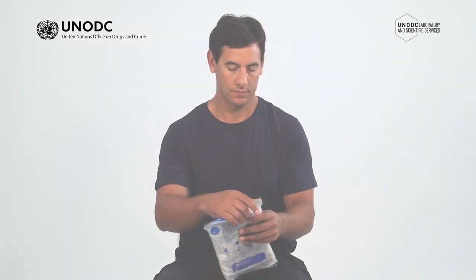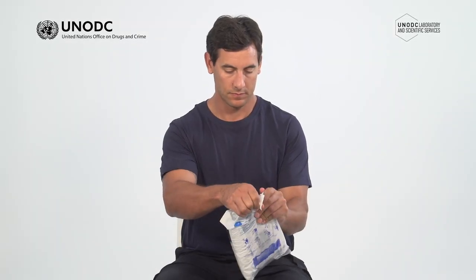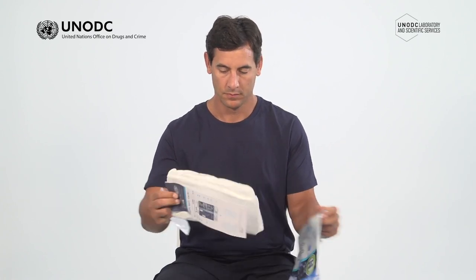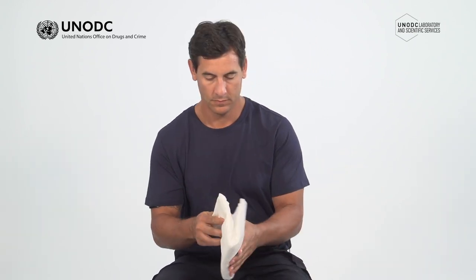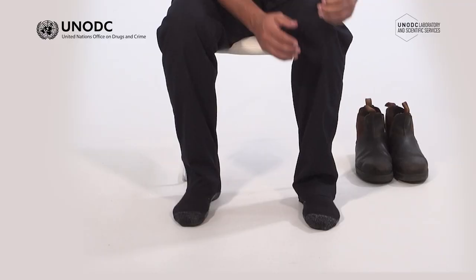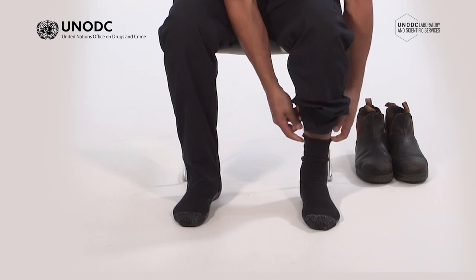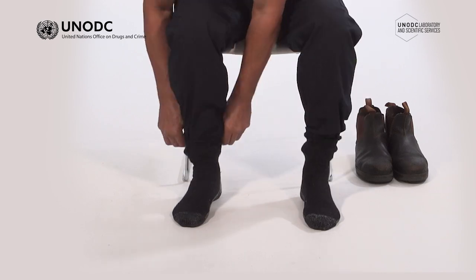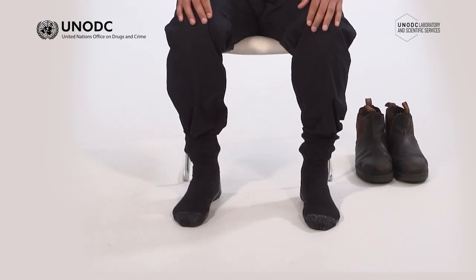Carefully select the correct size of chemical-resistant coverall and check the expiry date. If the suit is too small, it can rip, split, or not allow you to have free or functional movement. It's better to be one size too big than too small. The PPE should always be put on in a clean environment. Putting on the suit is easier if you can sit down.